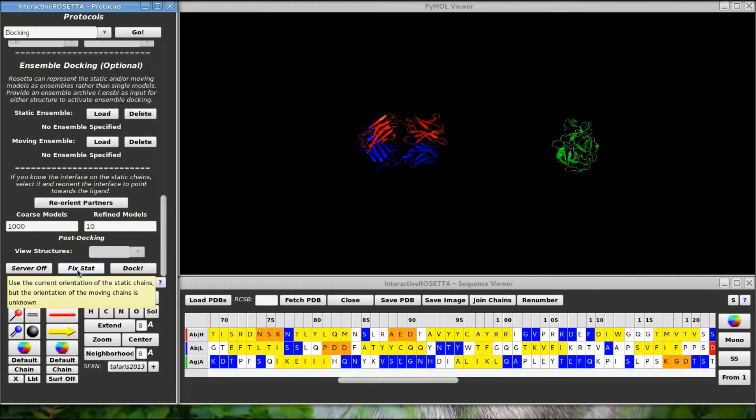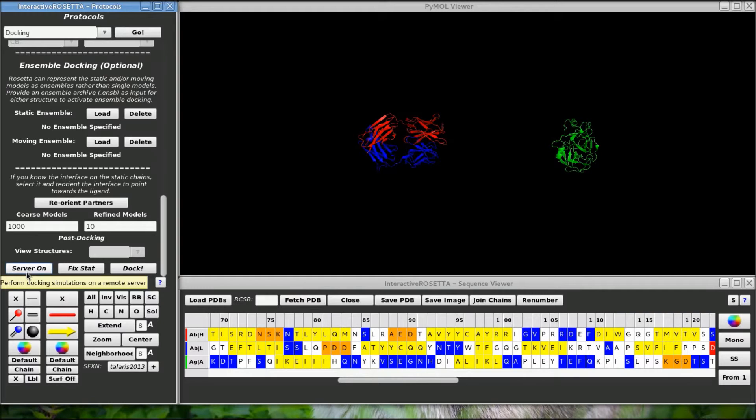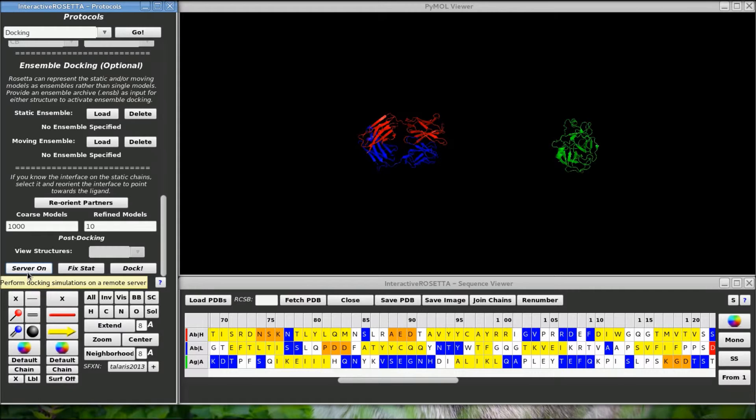I'm going to perform 1000 decoy models and then return the top 10 refined structures. Without the server, you will run docking on your computer and it will perform 1000 course docks quickly and take the top 10 of these models for high resolution refinement. So let's use the server. Click dock.